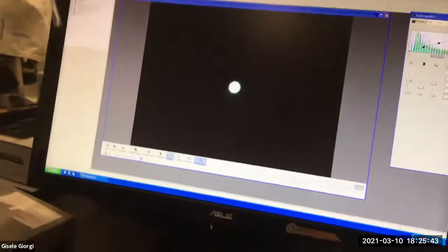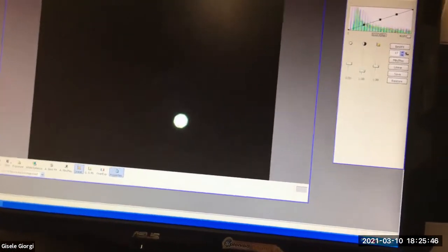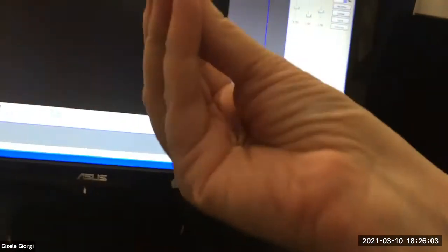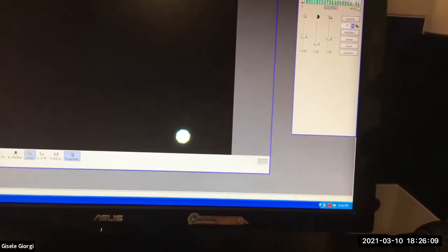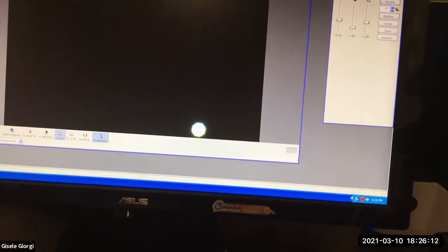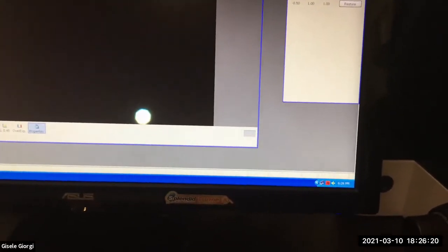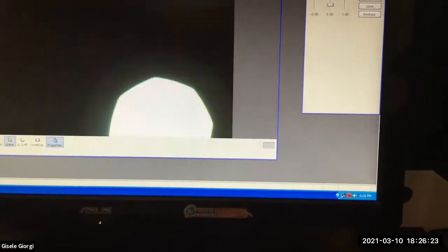If it's really lost and it's somewhere, let's move it. A lot of times with scopes that have been really mistreated, you'll find that your light is down here or something like that. You're like, well, no wonder you can't see anything. Your light is totally oblique. It's coming in from an angle. It's supposed to go straight up to your specimen, and it's actually kind of sneaking in from the side, and things might get interesting, but it's not what you want. So sometimes if your condenser is so far out of whack, you do want it all the way down. I don't know why, sometimes it just feels easier to find it that way.